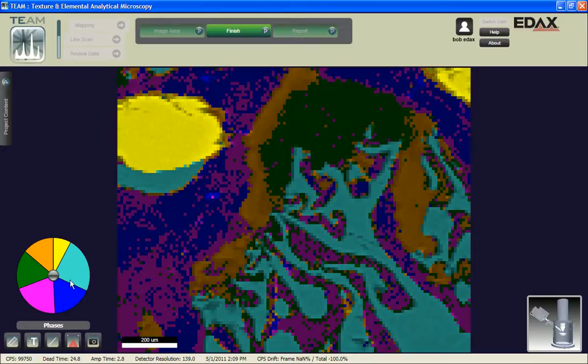And the other 4 phases are almost the same. Silicon, aluminum, oxygen, sodium, potassium. Then here's no potassium. It's silicon, aluminum, oxygen, and sodium. And this one is silicon, aluminum, oxygen, and sodium, exactly the same list, but different proportions between the green and the red. And then the orange, or the gold, I guess it really was, is silicon, aluminum, oxygen, and potassium.